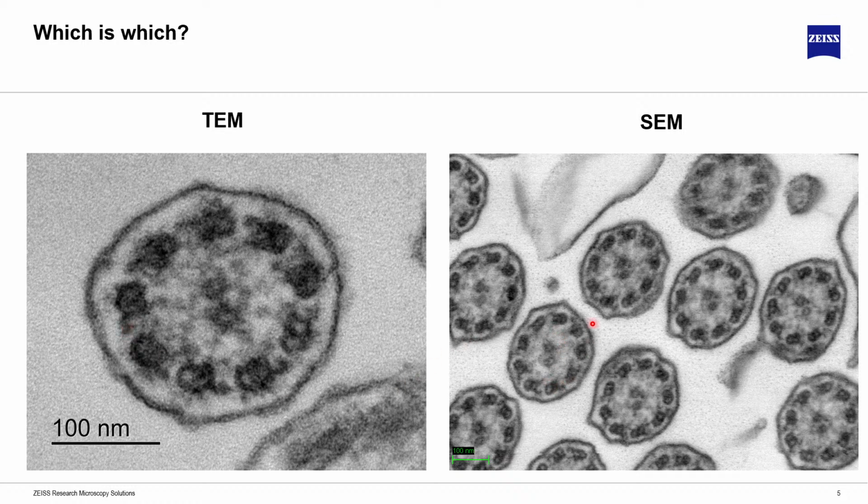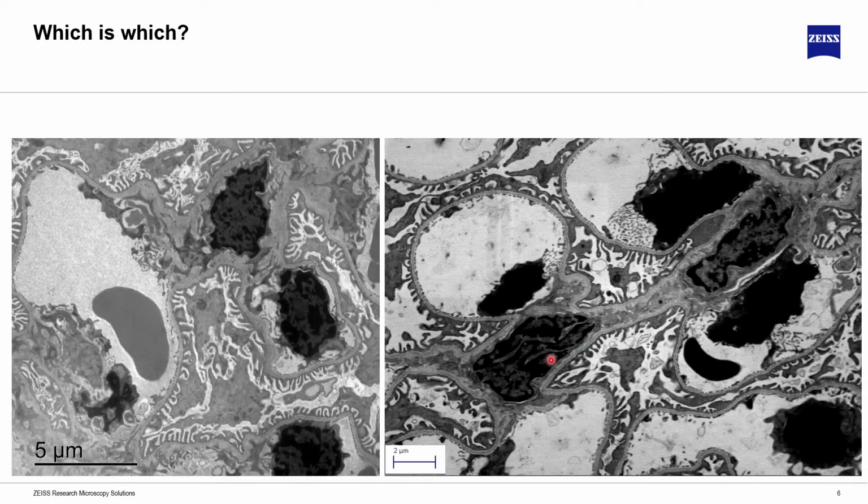But look, here in the SEM image, you can also notice the ultrastructure of the cilia, even the dynein arms, which is typical when looking for alterations in many different applications, especially for lung disease, for example. Then you can see the high quality resolution that you can get from an SEM image in STEM conditions, or STEM imaging.